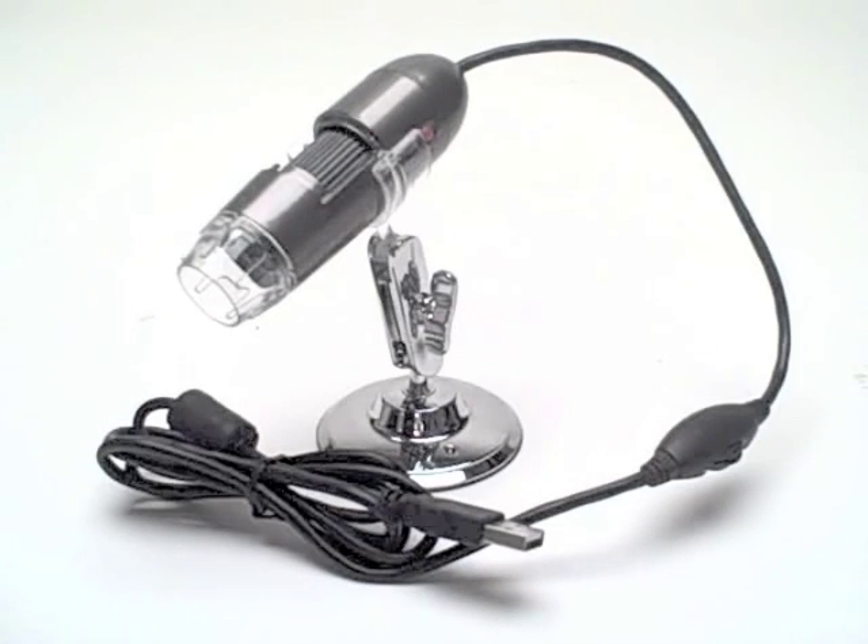The CaliPhone USB microscope will help open up the world of the physical sciences as well as nurture the innate curiosity in students.